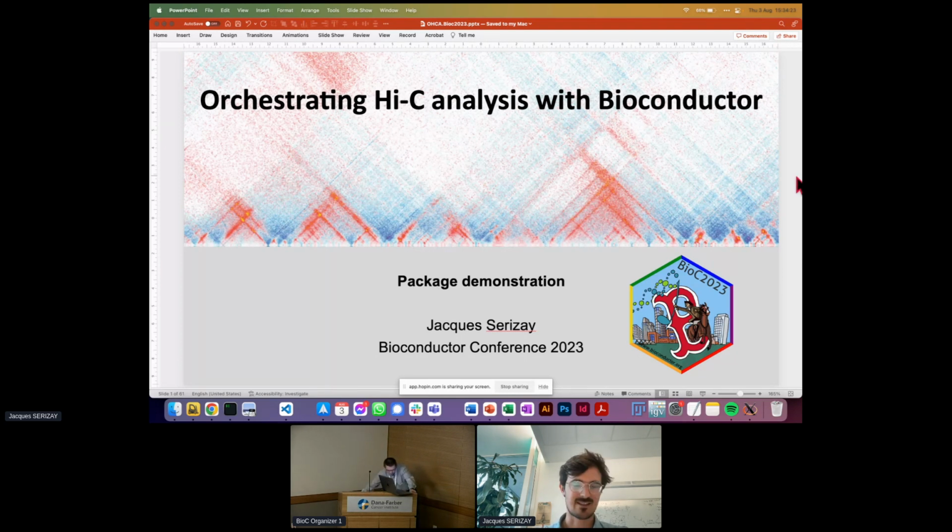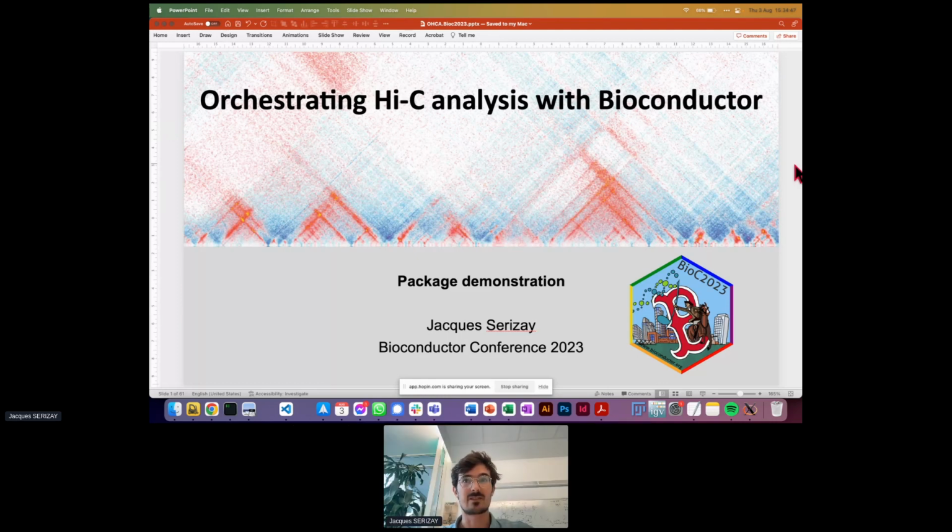Hi, and thanks for the introduction, and thanks for letting me present the work I've been doing over the past few months and years, actually. This is the first time I attend the Bioconductor conference, so hopefully you guys will be pleased with the presentation and the demonstration I'm giving. I'll be talking about orchestrating Hi C analysis with Bioconductor.